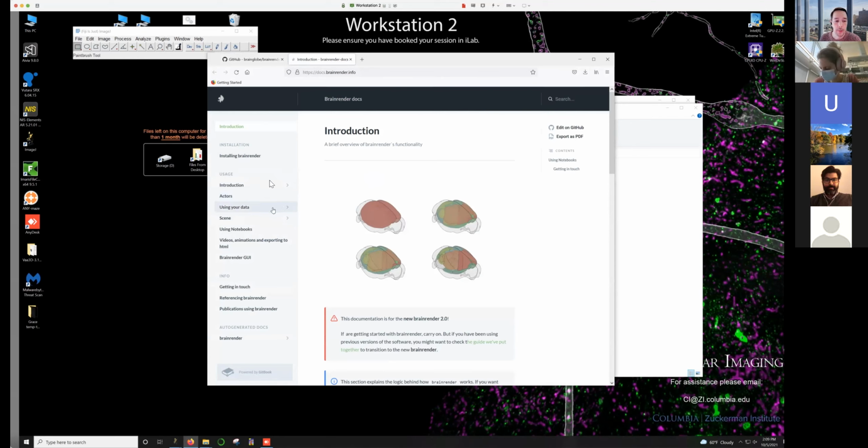And after today, if there's still something you need a little bit more help with, there's some basic documentation for a lot of the tools in here. But we'll be going through some of the more advanced features to actually get it to work with ClearMap and BrainJ.